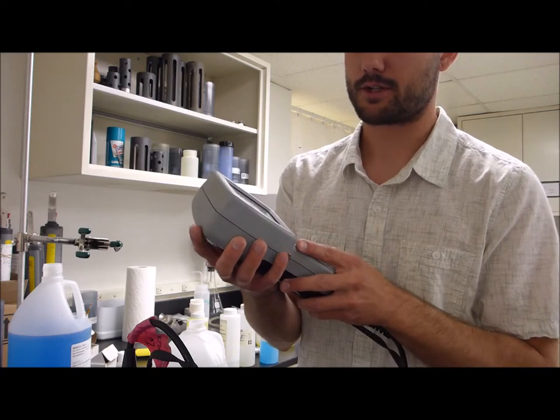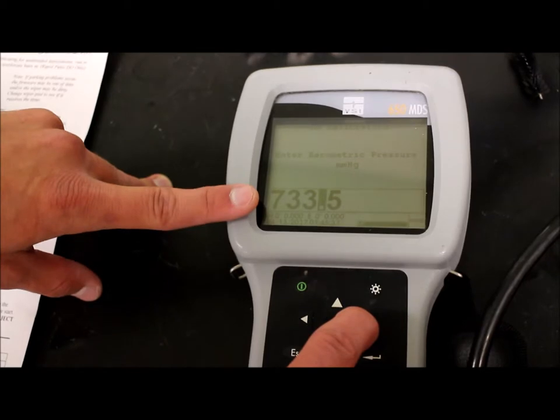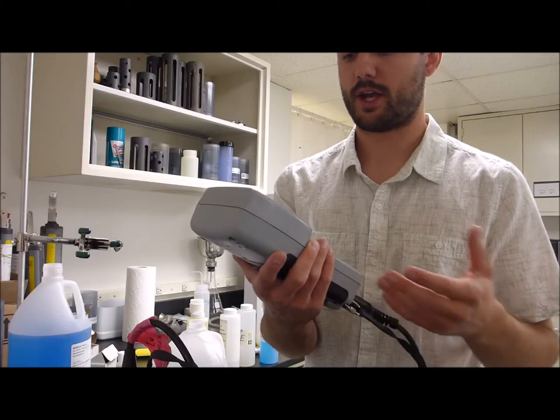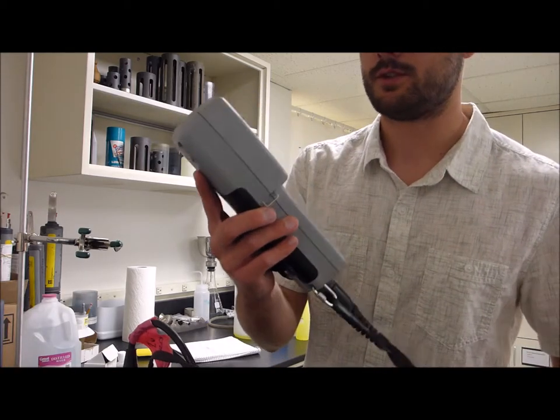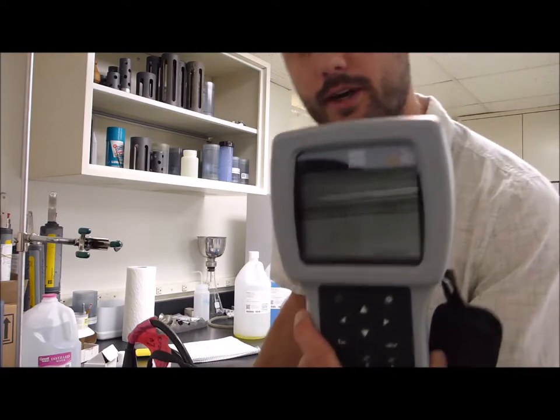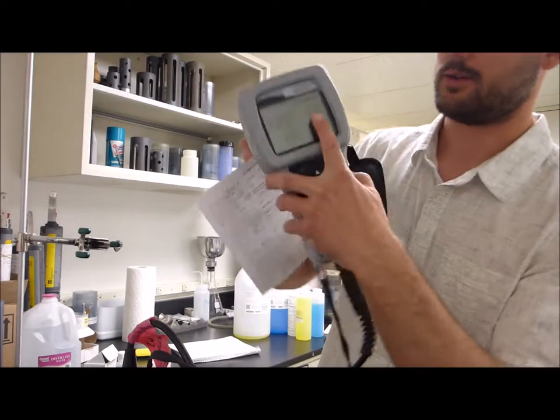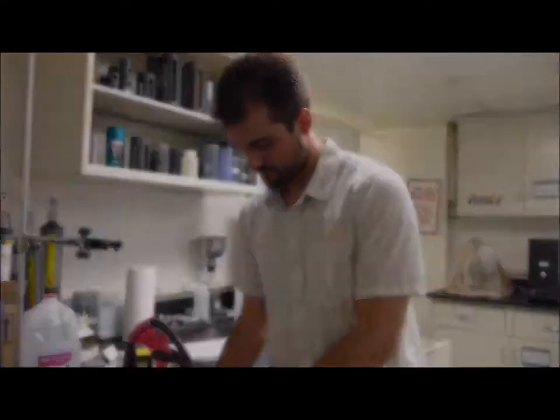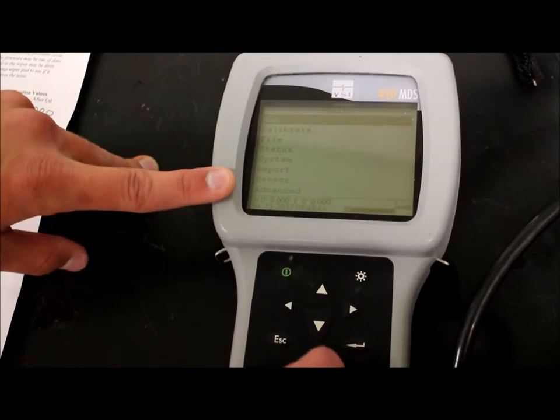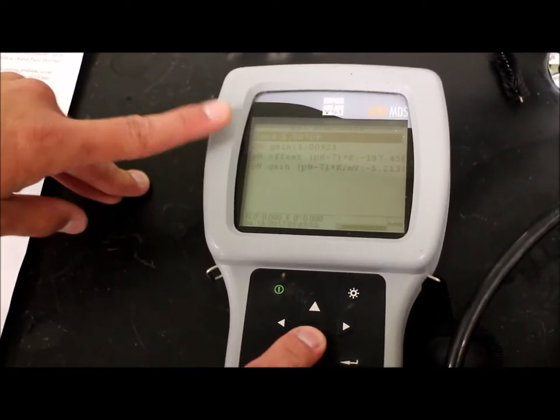Then we need an accurate barometric pressure. A lot of hand pads have a built-in barometer. This one does not, but I looked it up. 733.5 is our barometric pressure. We're going to type that in. Most of them, if they do have a barometer, it'll auto-populate on here, so you won't have to type anything in. You can just hit enter. 116.2 it's reading. I'm going to hit calibrate, because it's stable. I'm going to write down that pre-before value, and then it calibrated to 96.5. So that will be my after. We'll want to write down the DO charge, which displays right here. 49.2 is the value. The last thing we need to write down, we'll go back into the advanced menu, and back to the cal constants. And we're going to write down the DO gain. So here it is 1.00921. And that, again, is within the range of .7 to 1.4.